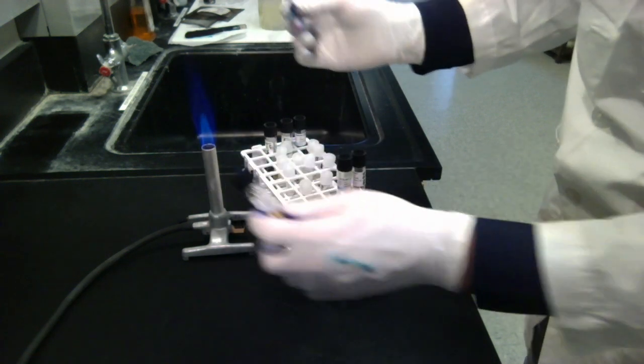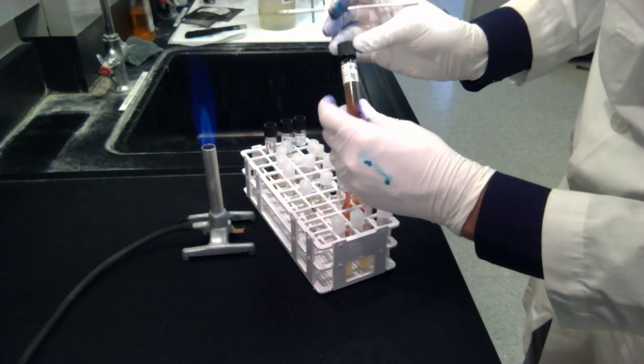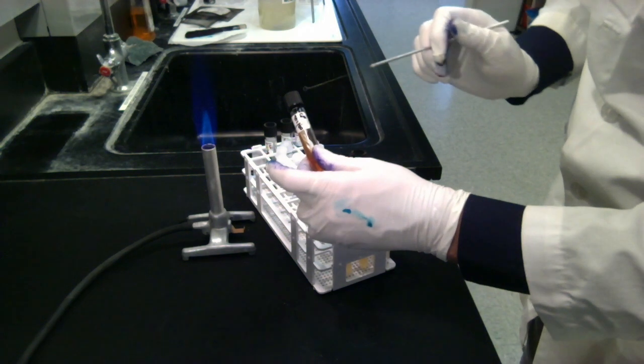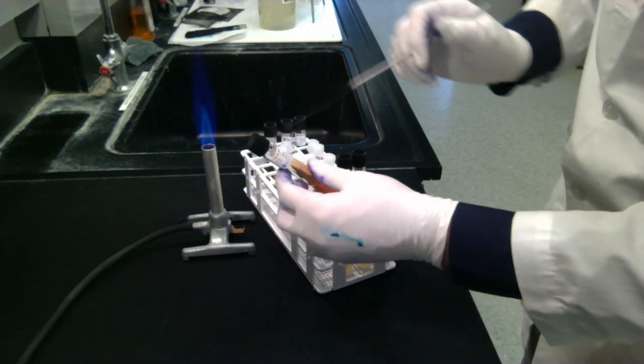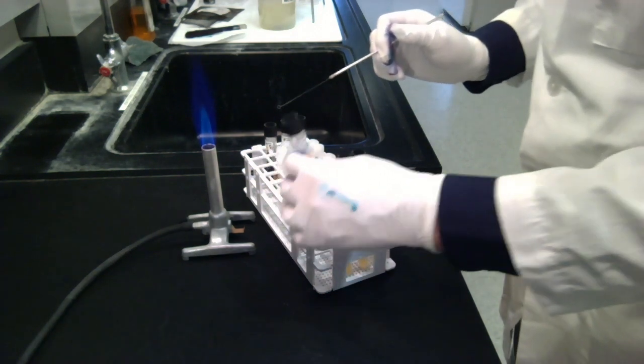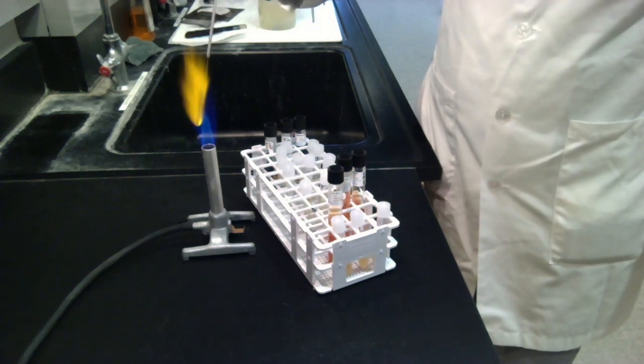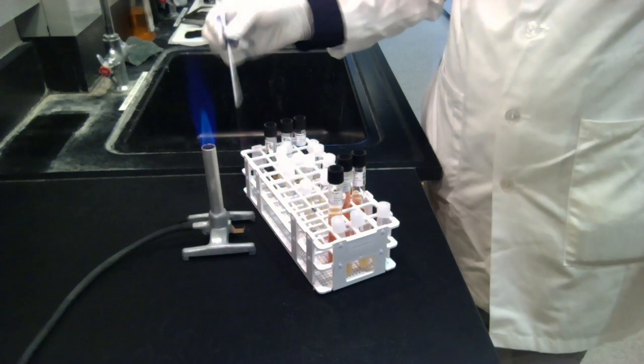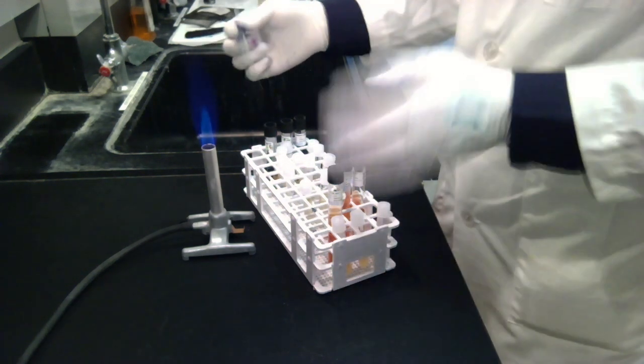You want to leave the cap loose like this. I like to tighten it all the way and then give it a half turn. That way the gases can escape. But also oxygen can enter in order to allow the bacteria to respire or breathe. And that's how you inoculate a TSIA.